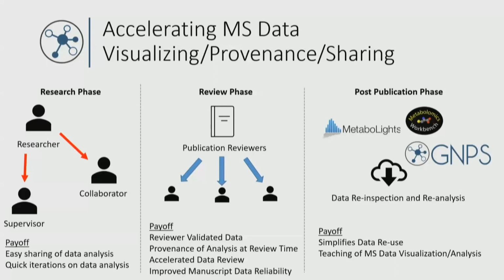This has big payoffs in checking that, number one, the data was made available properly, which is a huge, huge thing. And also it'll hopefully improve manuscript data quality. And then finally, at the very end of post-publication, once the paper is accepted, hopefully the data is deposited, with the GNPS dashboard, we hope that it simplifies data reuse.